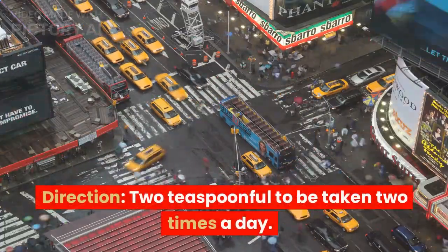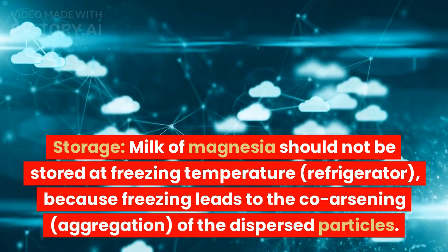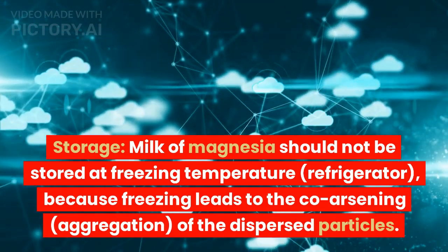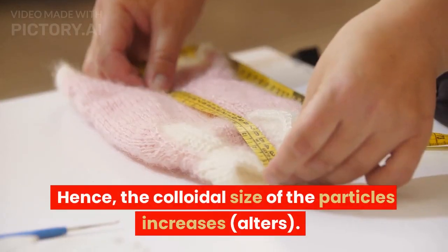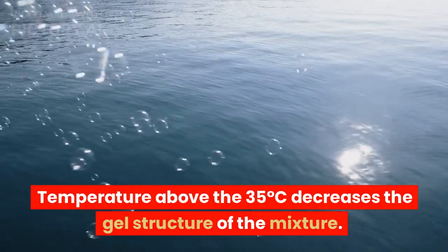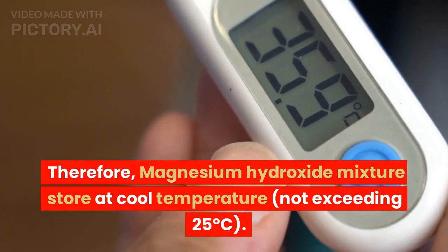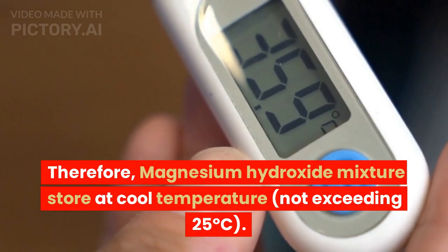Direction: 2 teaspoonfuls to be taken 2 times a day. Storage: Milk of magnesia should not be stored at freezing temperature or in a refrigerator, because freezing leads to coarsening and aggregation of the dispersed particles, hence altering the colloidal size of the particles. Temperature above 35 degrees Celsius decreases the gel structure of the mixture. Therefore, the magnesium hydroxide mixture should be stored at cool temperature not exceeding 25 degrees Celsius.